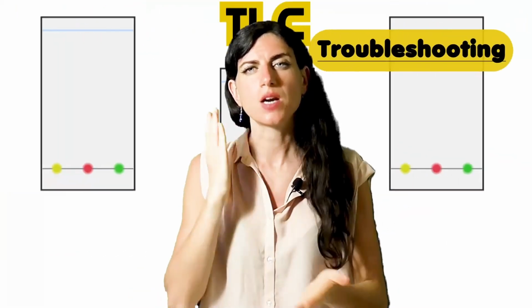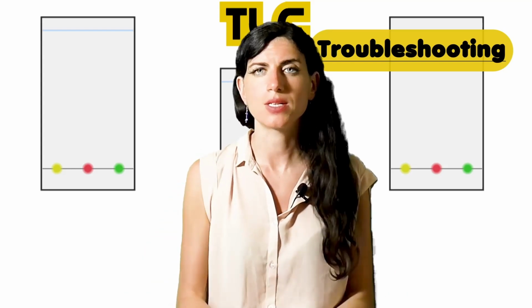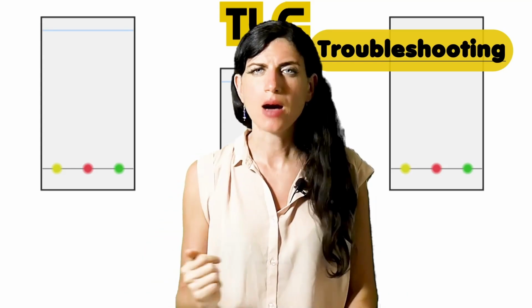Guys, in this new video we will talk about TLC troubleshooting. So the most common problems you can encounter when you are doing TLC. What are these problems and how to solve them?